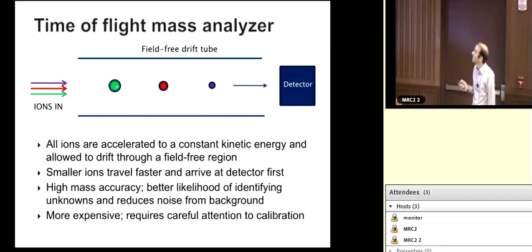So ion suppression, what exactly is it? It's something that causes reduction in response of an analyte of interest, the thing that you're trying to measure, your metabolite, in the presence of an interfering substance. So something else in your sample.